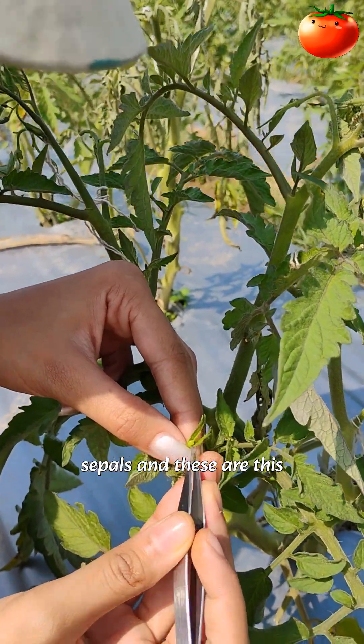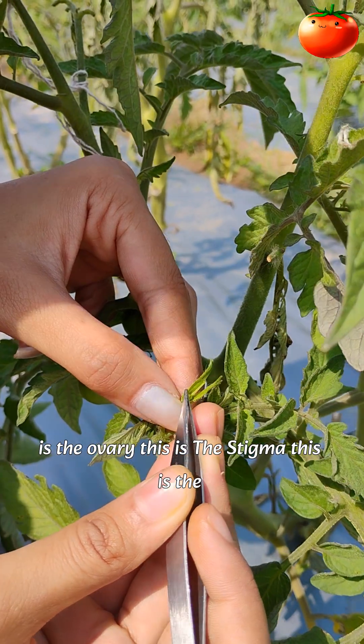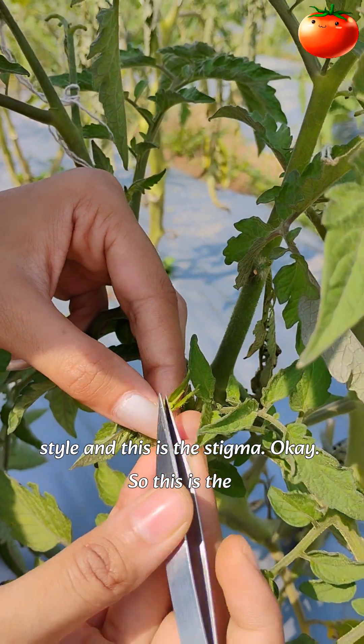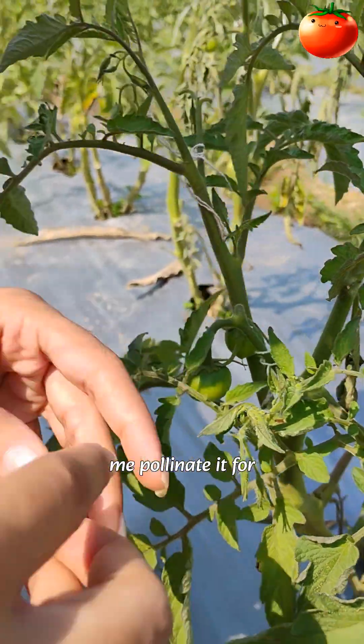Now we have the sepals, and this is the ovary, this is the stalk, this is the style, and this is the stigma. So this is the female part. Now let me pollinate it.